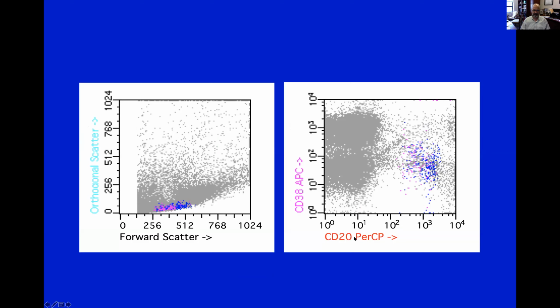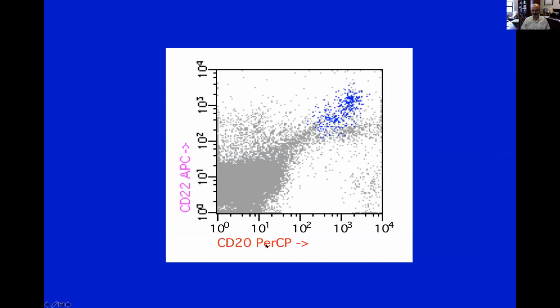So in this particular case, Steve ended up getting an extra marker with CD20 and CD22 included. And so in this new tube, as you see, there is CD20, CD22. And you can see that on the CD20 bright side, where we were expecting a population, CD22 is also bright. So if you squint just right, maybe this is a cluster that you could divide out of the B cells. So here are B cells, here are some more B cells.